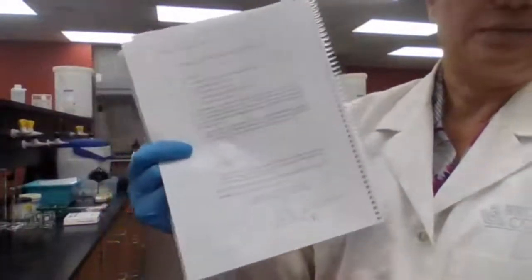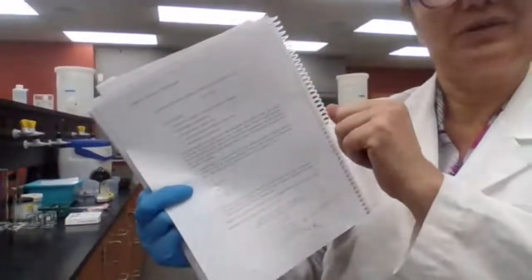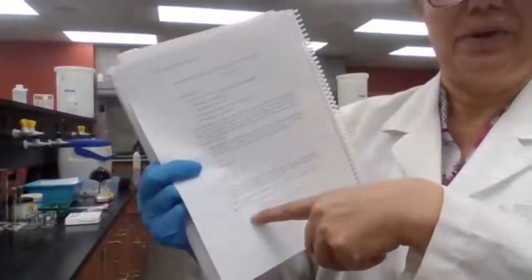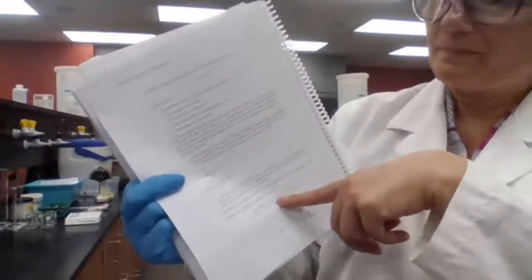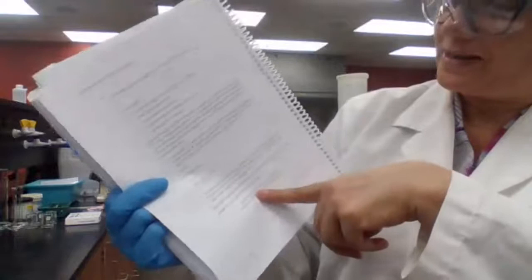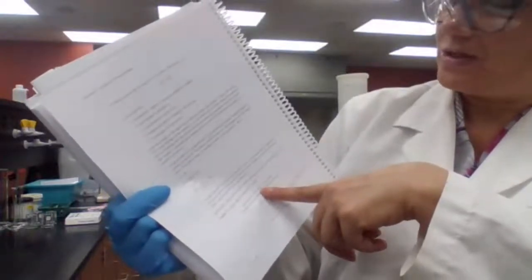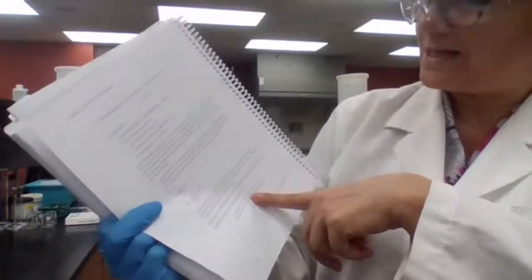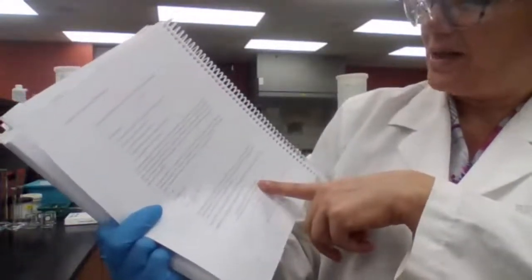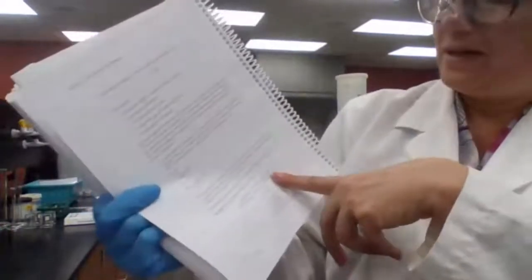If I find the observed rotation, then I calculate the specific rotation. When I have the specific rotation, then I compare that with the specific rotation of the pure sample. So I divide the specific rotation of the observed by the specific rotation of the theoretical value, which is 40.3, as I said, times 100, and then I get the optical purity, or enantiomeric excess.